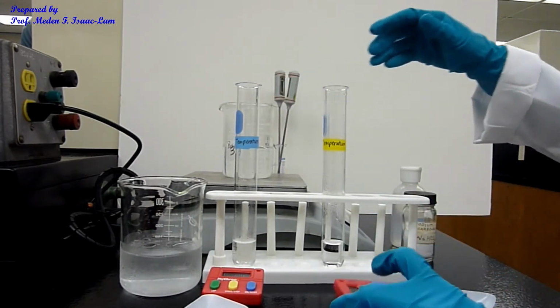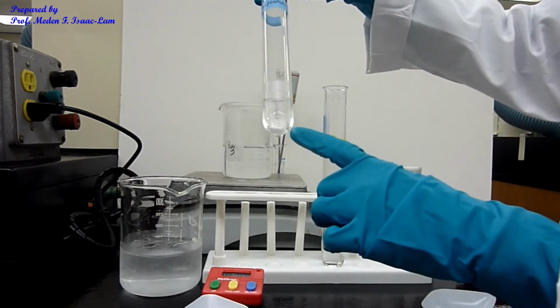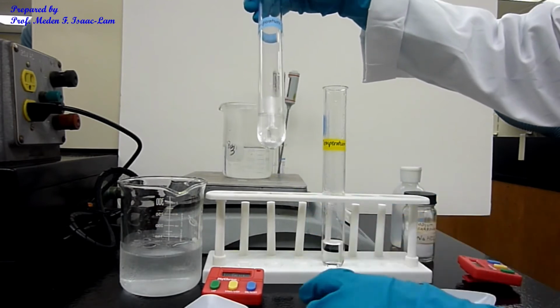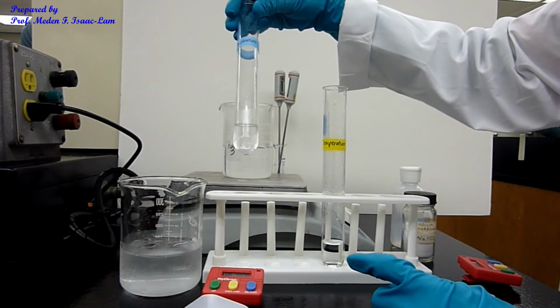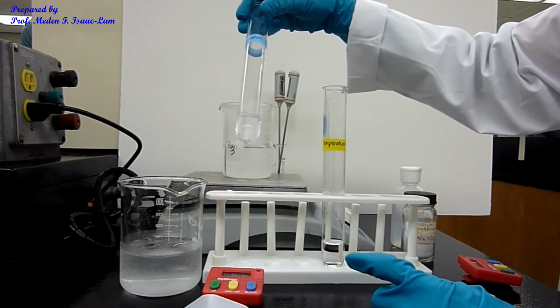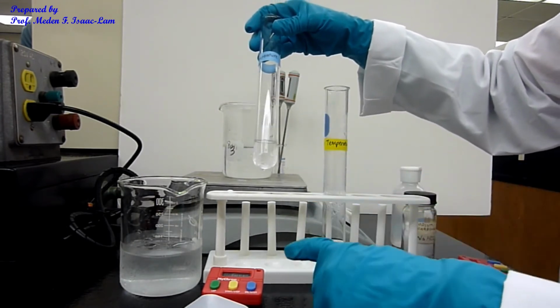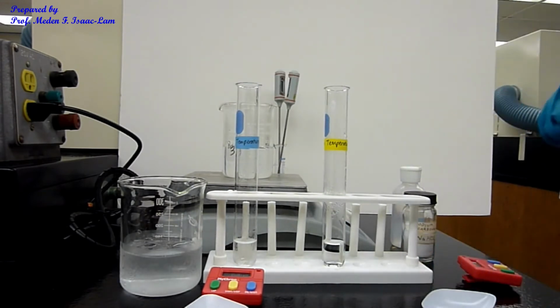So it's about 20 seconds for the high temperature. However, this one is still reacting, and it's about 38 seconds. So completely reacted at about 1 minute and 15 seconds. So that's the effect of temperature on the reactivity, or the reaction rate, of sodium bicarbonate and hydrochloric acid.